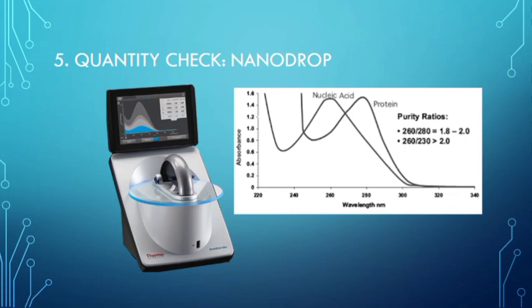Generally we see that the 260/280 ratio is very important for PCR amplification, and the 260/230 ratio generally does not cause hindrance in your PCR amplification. So always look for the ratio of 260 to 280.